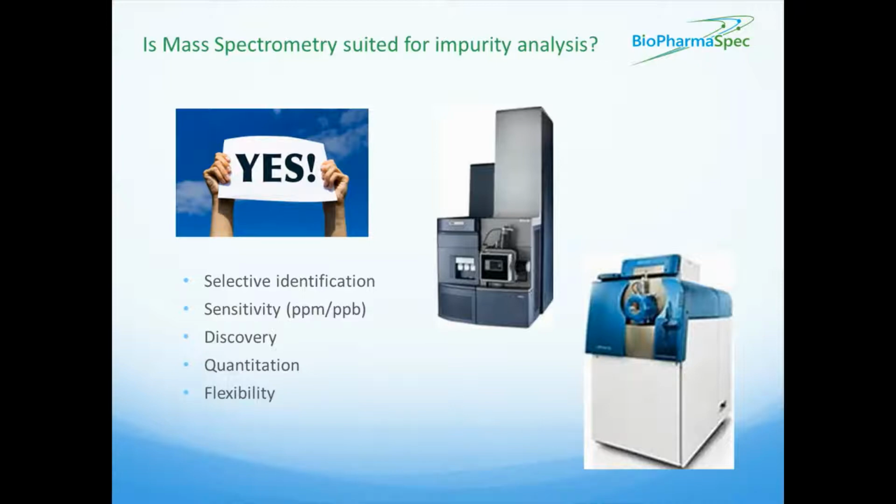impurities. Now, when you're trying to achieve absolute concentration estimates with very accurate concentration estimations, it's very important that you use internal standards that have very similar or identical properties to the analyte being tested. A couple examples of such standards could be heavy isotope labeled peptide analogs or actually spiking the analyte in itself.